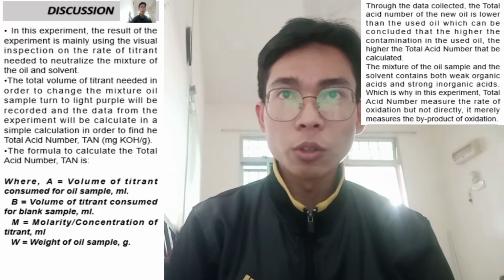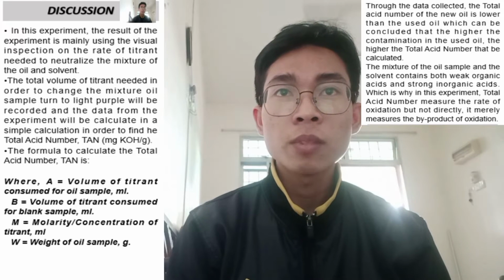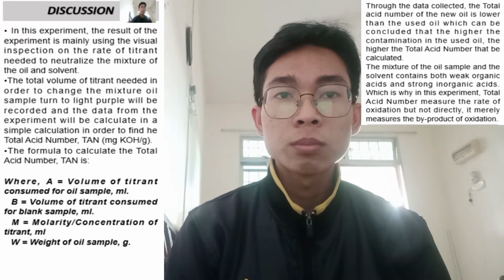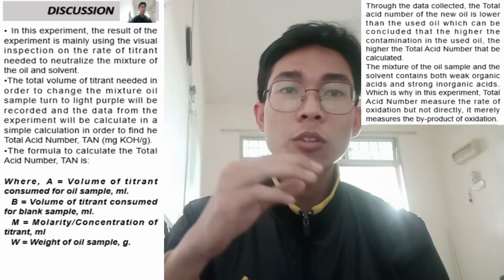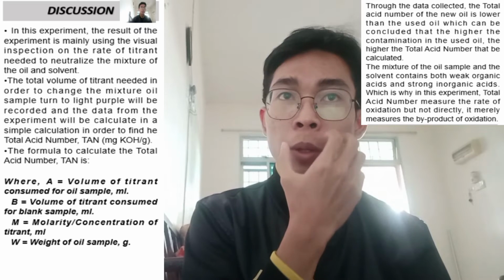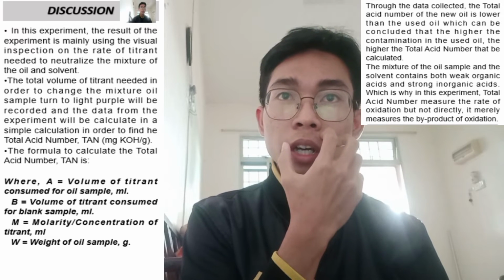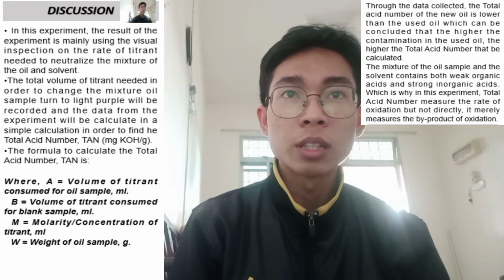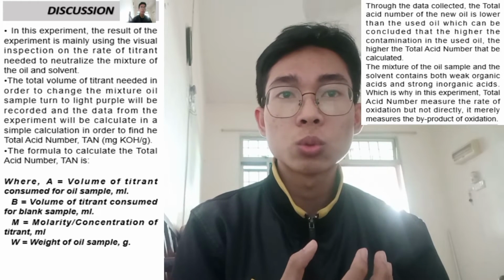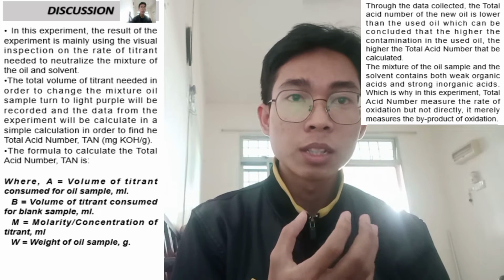The total volume of titrant needed when it is mixed with the mixture of the oil and solvent, and when it reaches neutral, the color will change into a light purple.